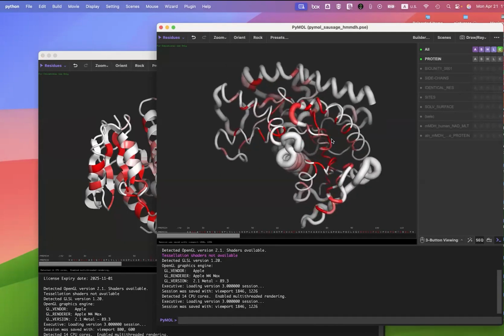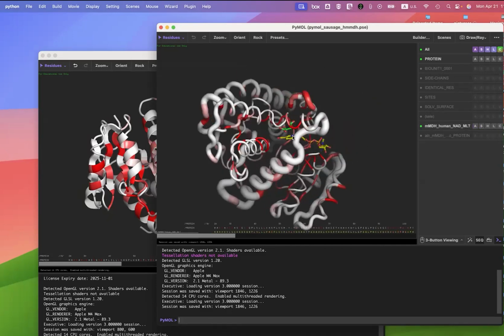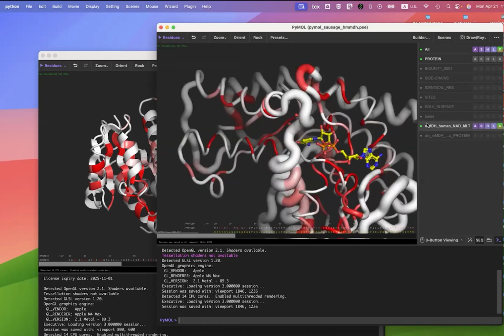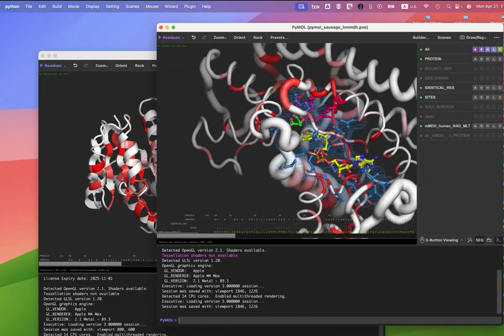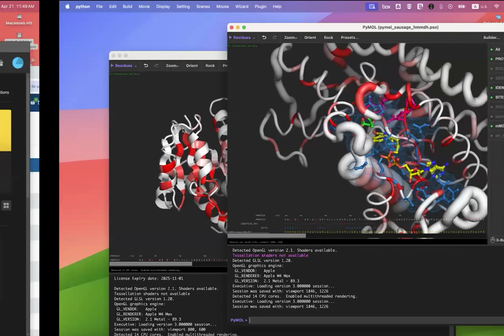And so the skinny regions too, you'll see a lot of them are going to be well conserved with that red. And these you can then do things like overlay with the substrates that you know, and you can see that those actually align to the active site. So that's pretty cool. You can see which ones are identical. You can do all sorts of various things, see the sites from the PDB file because it integrates all that PDB information in. So really, really cool stuff about that. But that's kind of like icing on top of the cake.